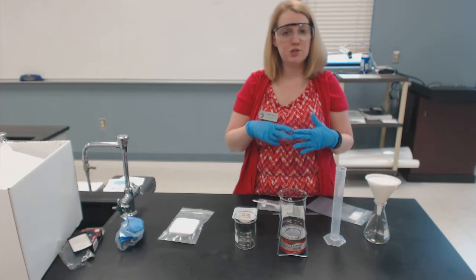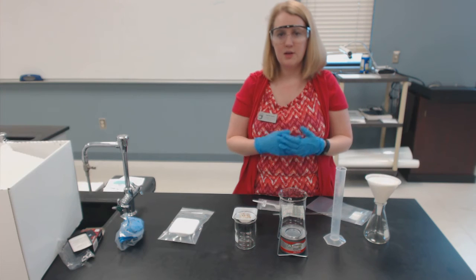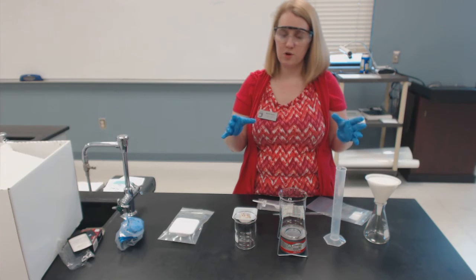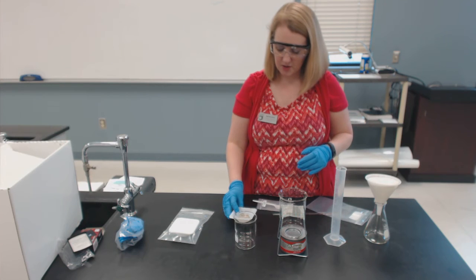And then after the conclusions, there are 2 post-lab questions that you'll get from the handout that need to be answered. Make sure that those calculations for percent composition are showing all of your work for them, for trial 1 and trial 2. So you're going to do this twice.